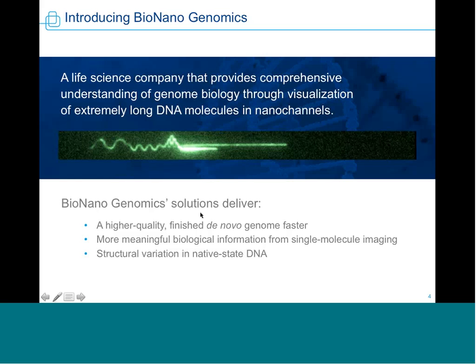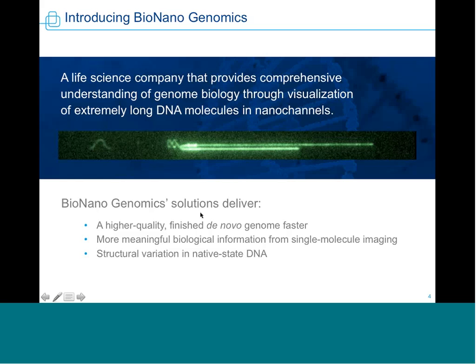Here's a video, hopefully this comes through the webinar okay, where we are actually pulling the DNA molecules. By applying a voltage, we can pull the DNA molecules into the nanochannels. They go through a series of pillars where they unwind from their natural coiled state in solution, and then they stack up again at the mouth of the nanochannels where they're fully stretched. So you can see this video of very long molecules.